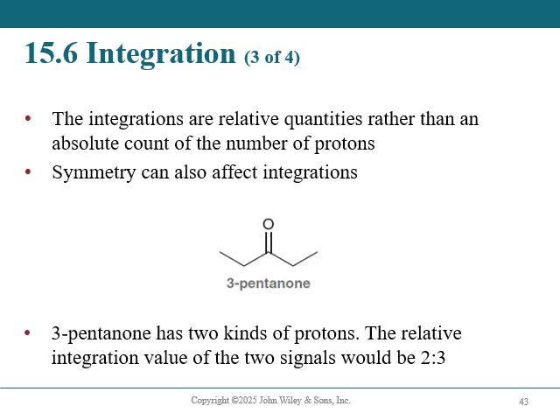The integrations are relative quantities rather than an absolute count of the number of protons. In other words, they're a ratio. So a 2 to 3 ratio could mean that you have 2 protons on one side, 3 protons on the other.